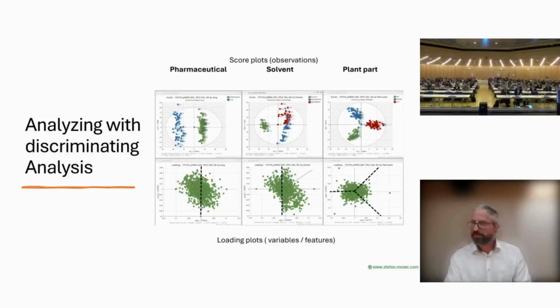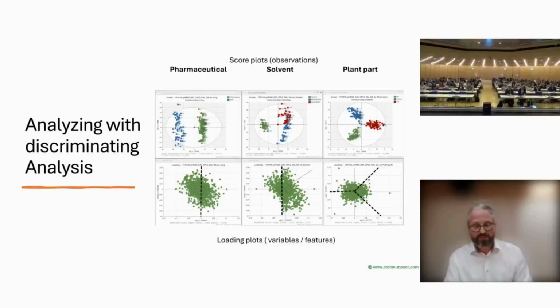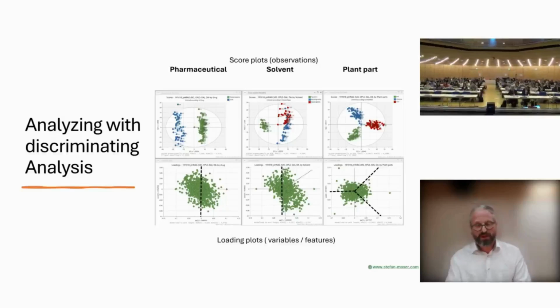In the next step, we explore the effects of different factors, like solvent type, plant tissue, exposure condition, and so on. Different extraction solvents already produce noticeably different metabolite profiles, so solvent choice is far from a minor detail. Likewise, roots, leaves, and stems show distinct metabolic signatures. The variability can make interpretation more challenging, but it also enriches the dataset and gives a more complete picture of biological responses across multiple dimensions.